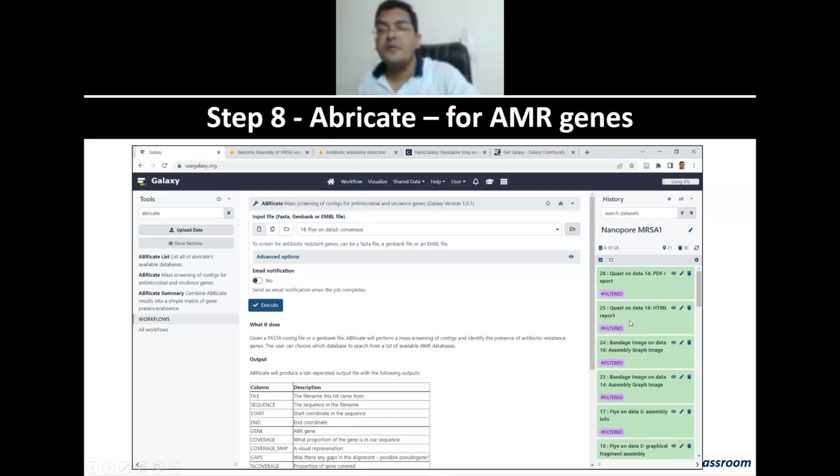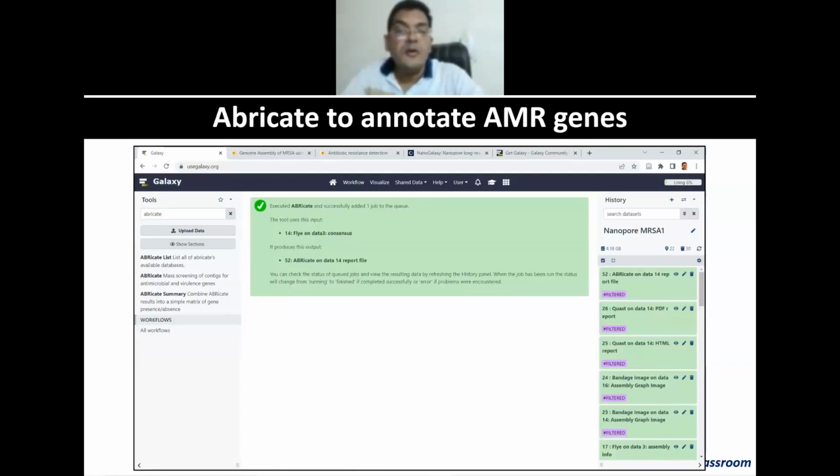So this will be your Quast on data. There'll again be an HTML file. So this is Quast. We are now talking of Abricate. So let's go to Abricate now.